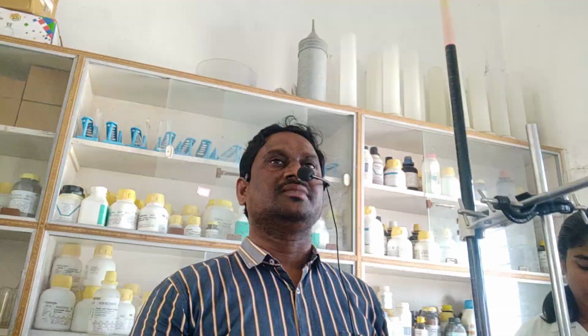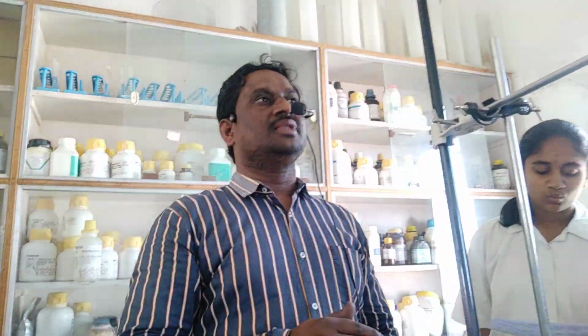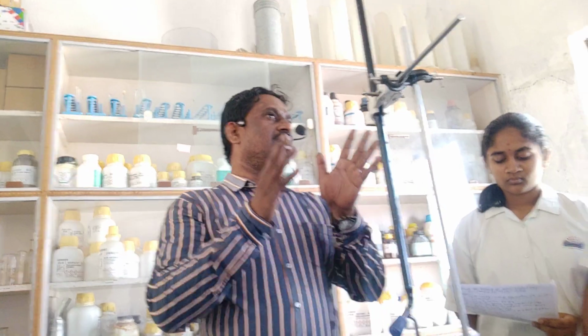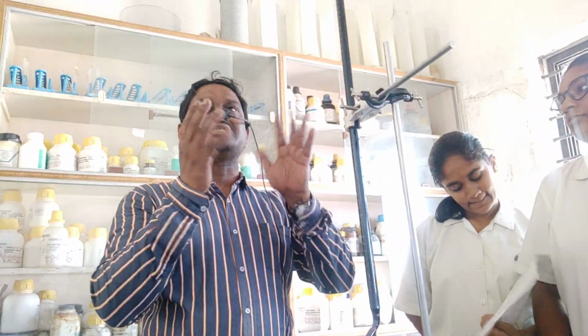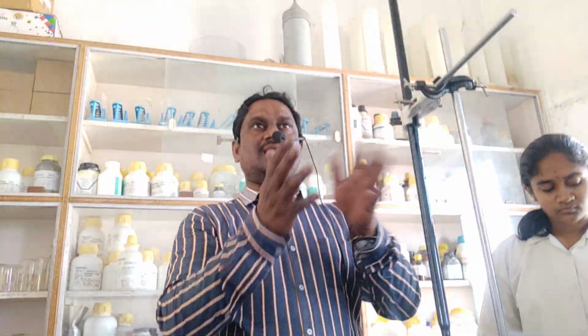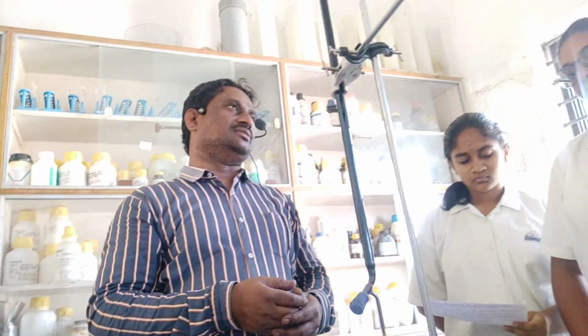Now the calculation, see. The formula for this experiment is A1 M1 V1 equals A2 M2 V2. A1 and A2 are fixed here. What do A1 and A2 mean? A1 and A2 represent the oxidation numbers. Already we have studied redox reactions. So redox reaction means oxidation and reduction taking place simultaneously. Here also the same thing. Why has the color changed here? A redox reaction has taken place between KMnO4 and the FAS solution. Are you understanding?